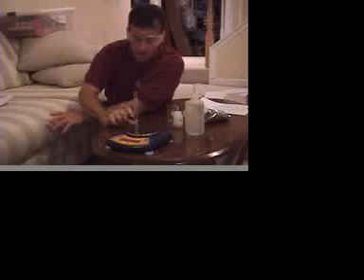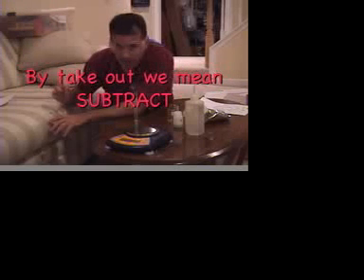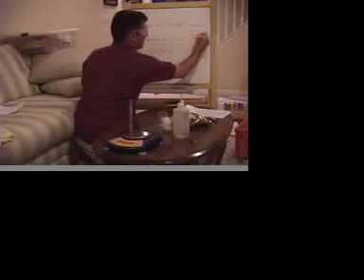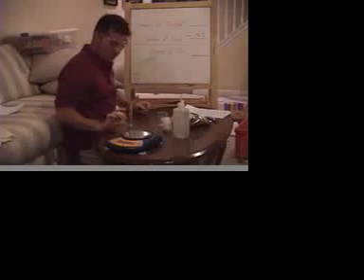On the lab there's a graphic organizer for this. It'll show you how to compute the volume of just the tin. It makes sense if you have tin and water and you take out the amount of water you started with, then it's just going to tell you how much tin is there. What we mean by how much is the volume of it. That graphic organizer is actually going to look a little bit like this. It says here the volume of the H2O, that's what you started with. That was 4.8 milliliters. Yours is going to be different than mine. Then it said the volume of the tin and H2O together. So after I put in the tin and the water went up, that's 6.7 milliliters.